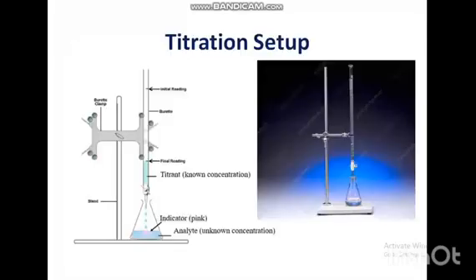Titration setup. In the lab, this is how you set up the titration apparatus. Retort stand holding the burette against the conical flask. Let's look at precautions taken while carrying out titration.